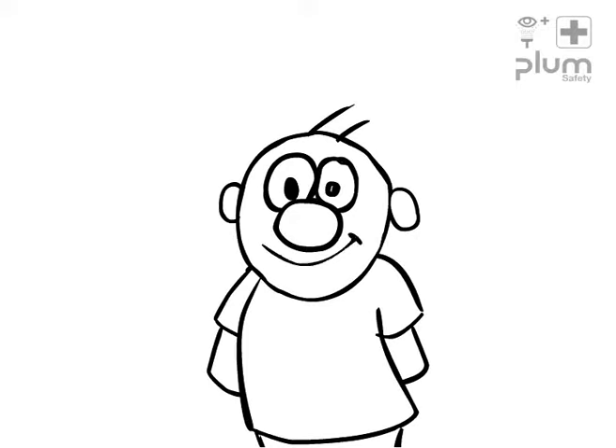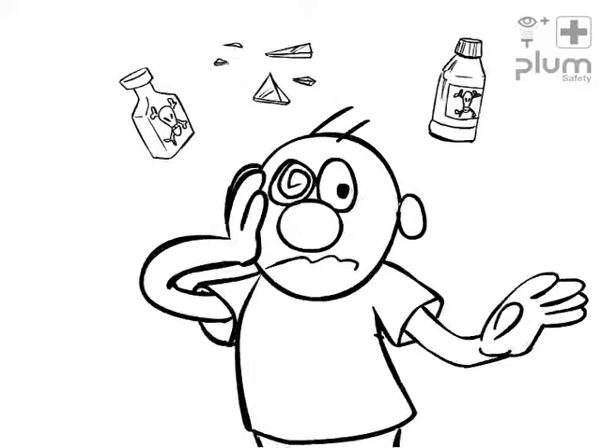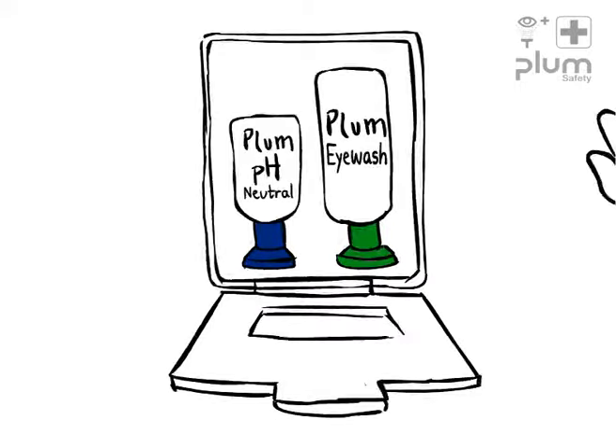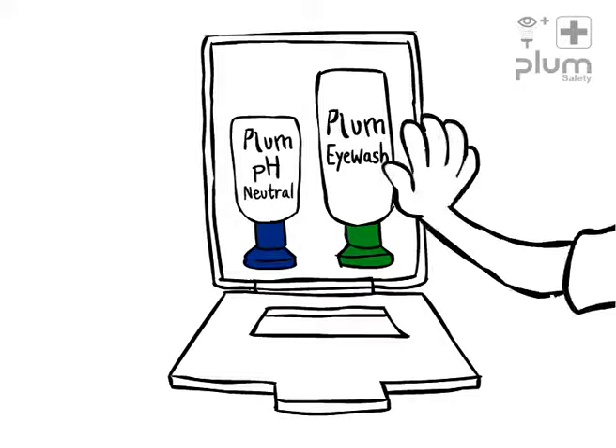Take good care of your eyes. If an accident should occur, you can make a difference in a few seconds. Always make sure you know the instructions for the chemicals you're working with to ensure you have the correct eyewash solution close at hand.